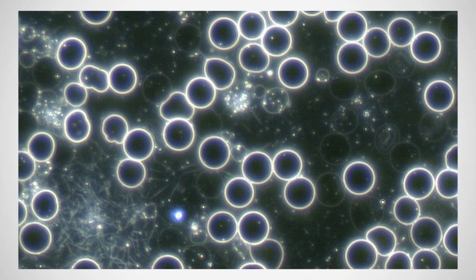All right, so also a few interesting pleomorphic patterns going on here. We have a few ghost cells as well, and some fermentation patterns basically seen in dark field, and then these faint lines again towards the lower left-hand side of the image. So fibrin, these are fairly common patterns that we encounter in practice, but really quite important. And if one misses them, then you don't really end up going in the right direction with the case in terms of treatment.